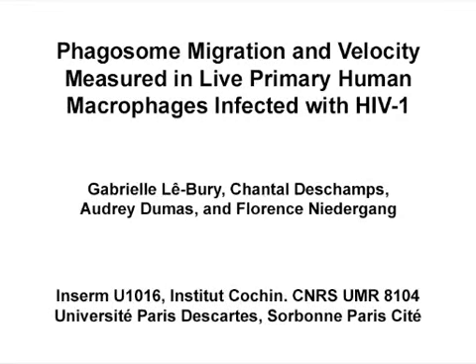The overall goal of this analysis is to quantify phagosome velocity in HIV-1 infected macrophages using a simple manual tracking method. The advantage of this protocol is to provide an easy method to calculate the relative movements of groups of objects within a cell that can be itself moving or deformed.